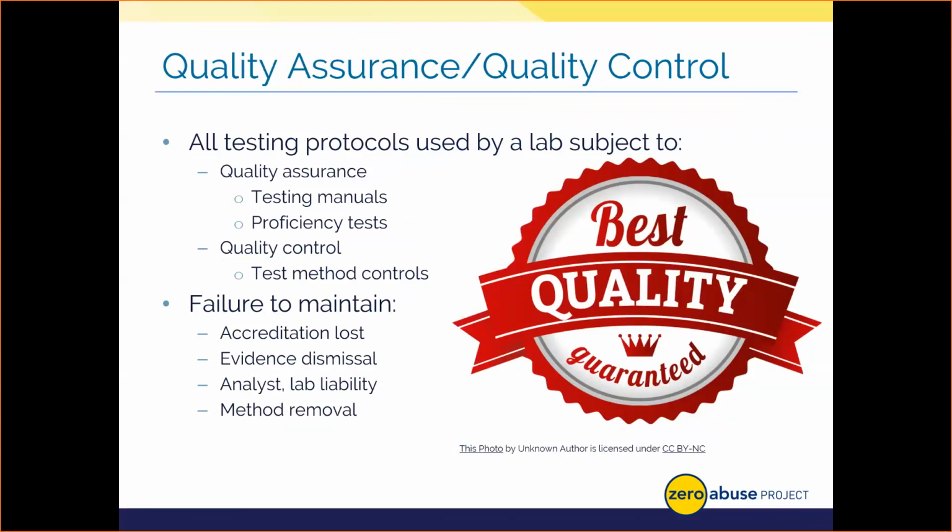All right, we have to document and maintain all QA/QC elements for accreditation if your lab is accredited, and to ensure that all lab items are processed according to the approved methods and within the constraints to which a lab can perform testing. If we don't do that, a lab can lose its accreditation. Evidence could be dismissed in court as a result. Analysts have faced jail time for using unauthorized deviations from lab methods without approval, right? So we really have to hone in on QA/QC, and that's something you should always look at with your testing labs or if you're choosing a new vendor.